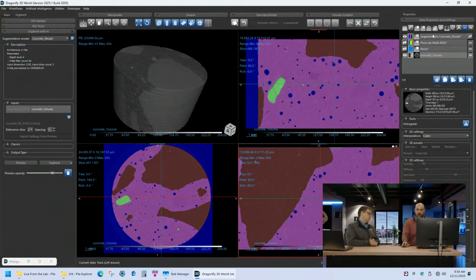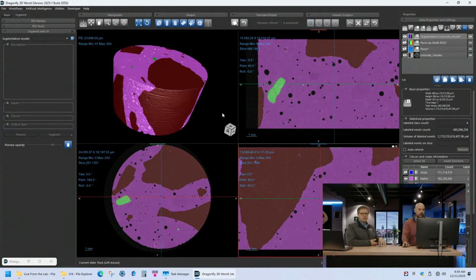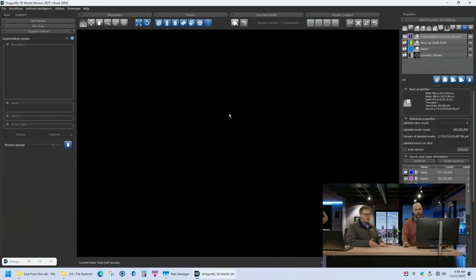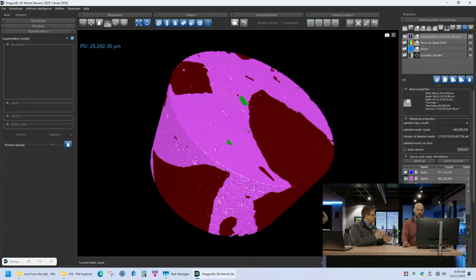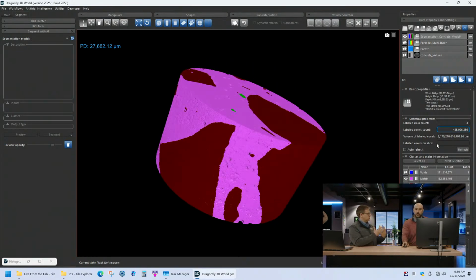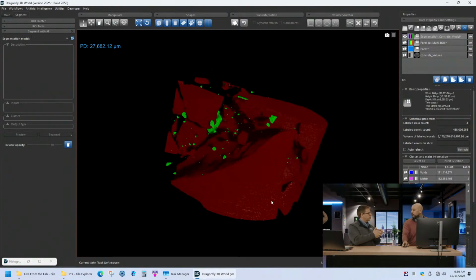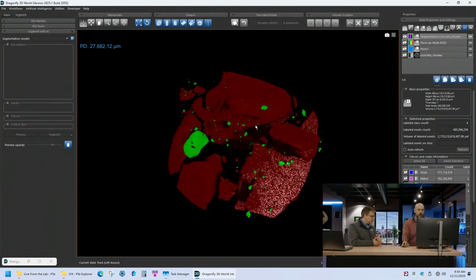So here we go. This is what we see. So let's open it in 3D. And how this is different, just to reinforce that, is that the pore one, you could easily segment the pores just based on the histogram type separation. But here it's taking into context how the image looks. It's taking into context this voxel next to this voxel, all of those things. And that's why I can get out these little bits, like those little tiny green chunks.